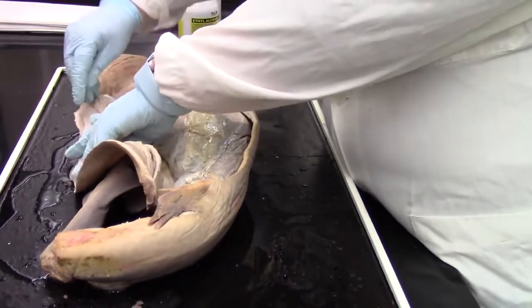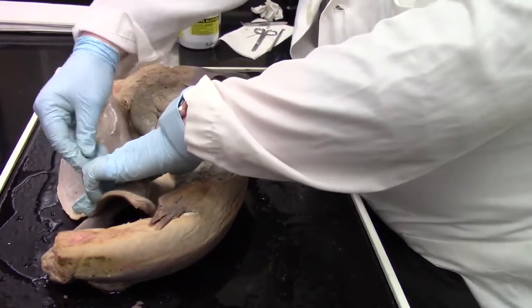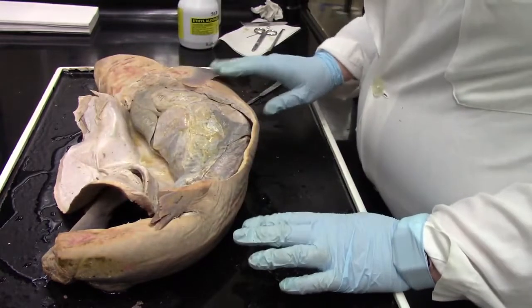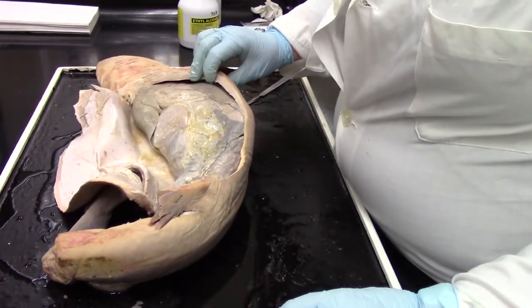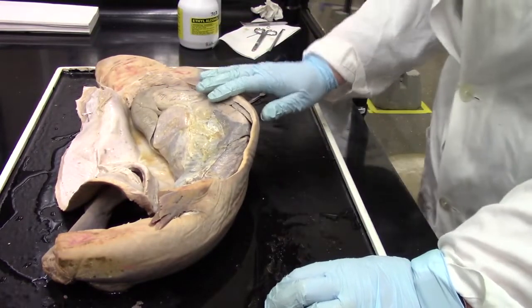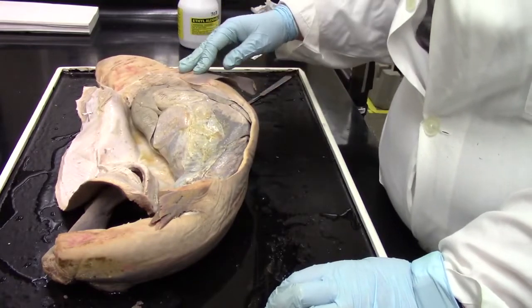And we'll just pin this open, and we can take a look at her internal anatomy. So you can see that her thoracic cavity is really quite packed full, and there's a good reason for that.